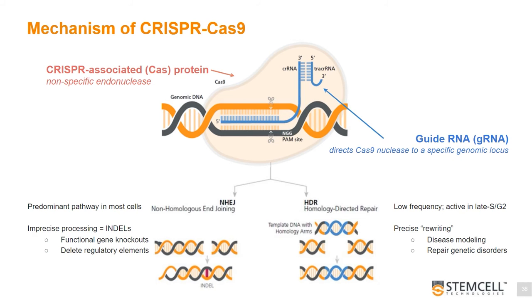Non-homologous end joining, or NHEJ, is the predominant DNA repair pathway in mammalian cells. So if the cell chooses to engage in this pathway after the DNA break, there are two primary outcomes. The sequence can return to wild type and be free of errors, or insertion and deletion, sometimes known as indel, can form if the DNA ends are processed prior to ligation. I will present two examples of CD45 and B2M knockout that are the result of the NHEJ pathway in a later section.